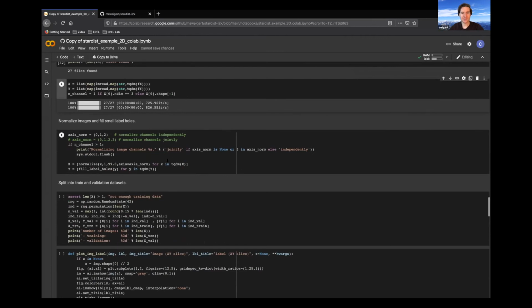And the next step is that you want to normalize your images. So typically your images contain values between 0 and 500 pixel intensity, whatever your camera, camera exposure and laser power is used. And the network always expects that your input is normalized in some way. And what we do, we squish the range of images into a range of 0 to 1 according to percentiles. So we calculate percentiles, and this is all done in one function that we provide. In this case here, we normalize images based on the 1st and the 99.8th percentile, such that we have a robust min and max estimation, because sometimes you have hot pixels and you don't want to use the max of a hot pixel to squash your data set to a super tiny range.